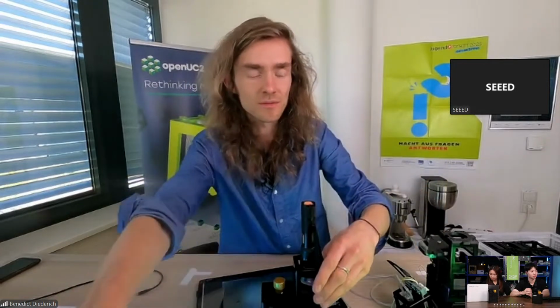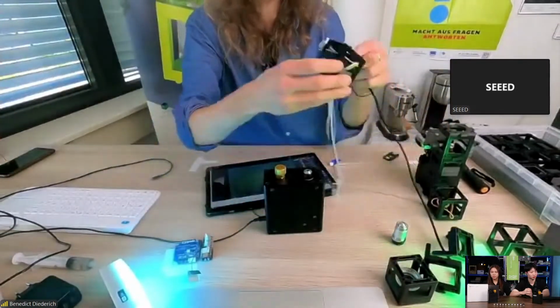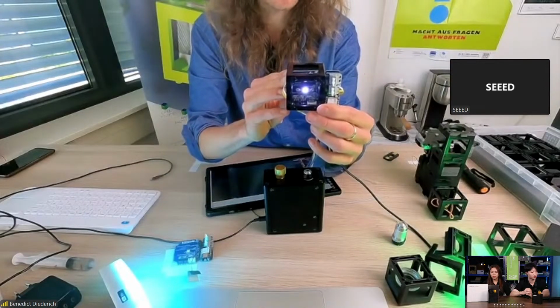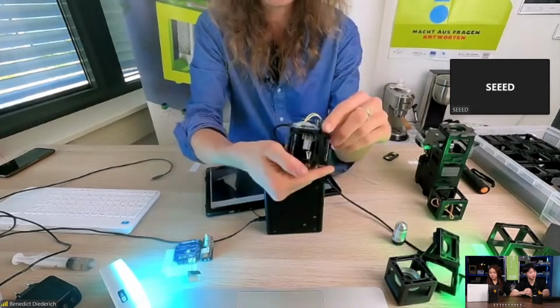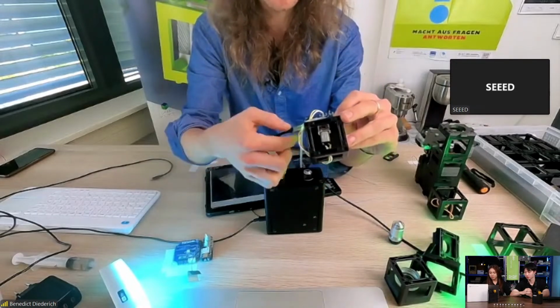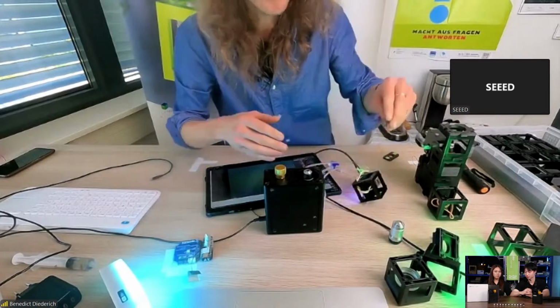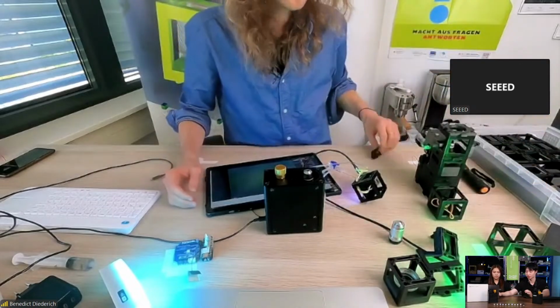If you have a look here, I'm just removing the torch and then removing this sample for now. And we have this already wired up. So you have the LED here. In that sense, it's a NeoPixel, and this can mount on the top here. And we have also a little peristaltic pump. This is essentially just pumping water through the pipes. This is cool for microscopy because you can then actually automate your system. So let me check where this stuff is.